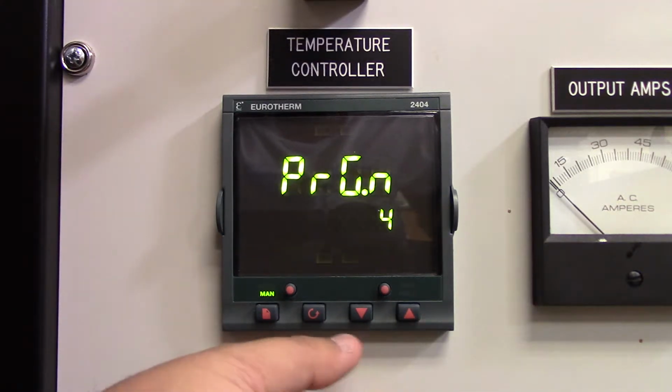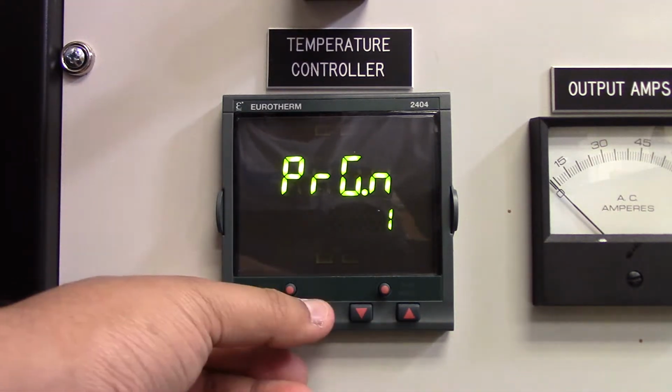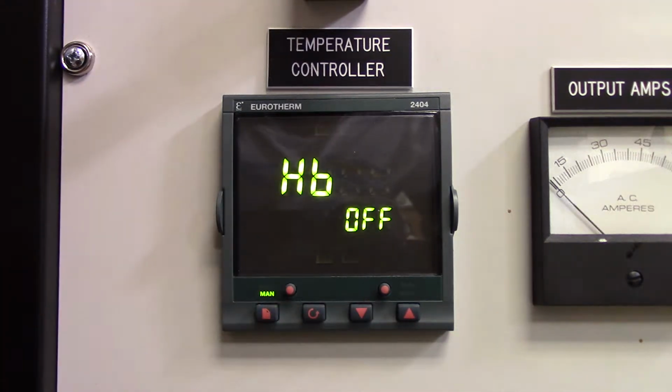And we're going to use these arrow keys here to show that we want to edit program 1. So now that we're in a subsection, we're pretty much just going to scroll through this menu. These subsections loop through, so if you accidentally make a mistake, it's okay. Just go back to the menu and then just re-enter program 1.